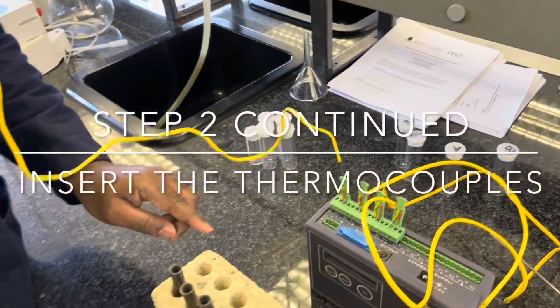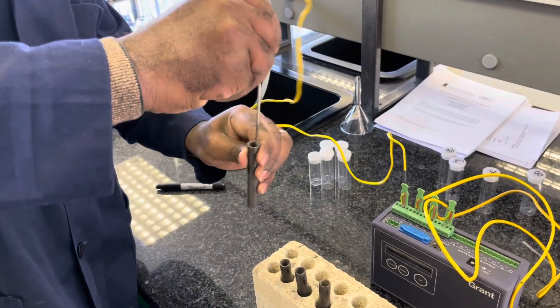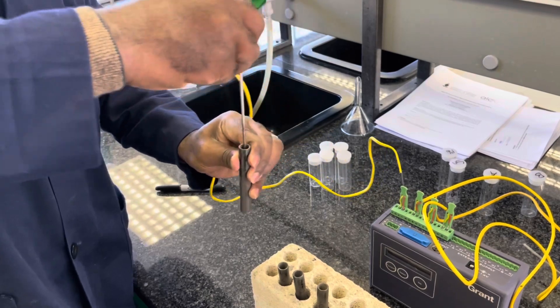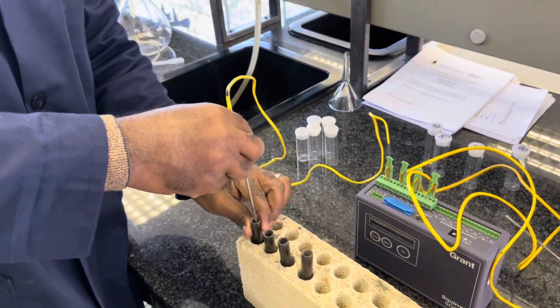Next we need to insert the thermocouple as deep as possible into the test tubes. Move the thermocouple around and drill a hole through the granules inside the test tube to ensure that it is nicely inserted.